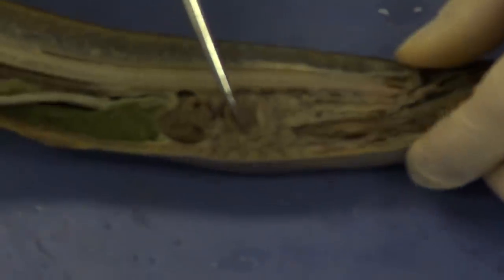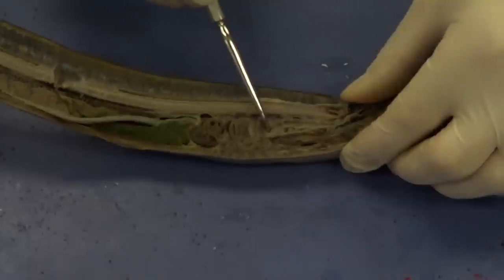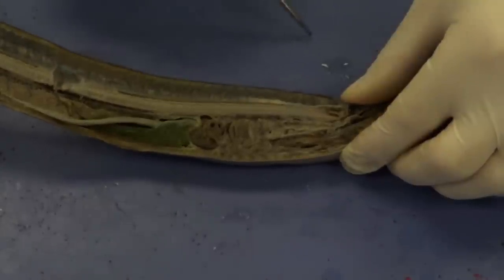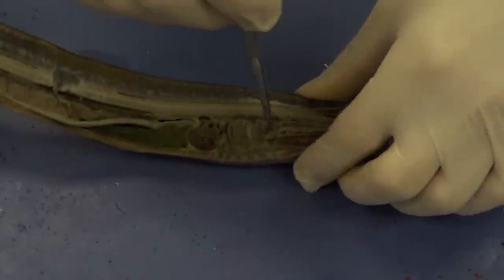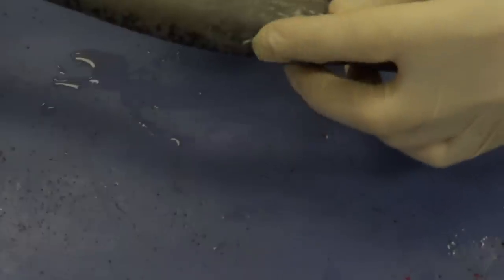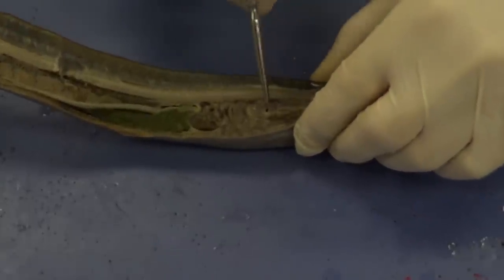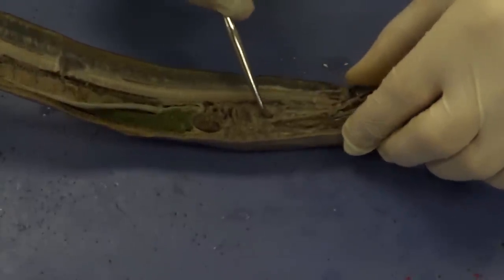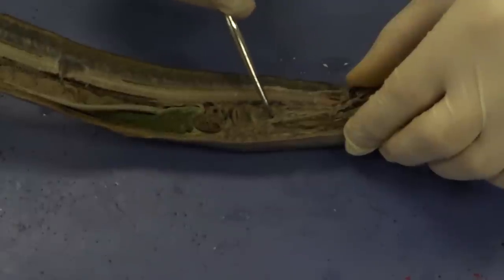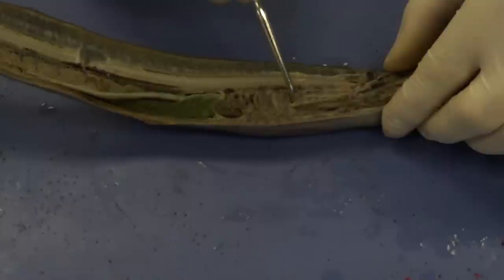These are all gills right here. We can see an opening — this opening is the internal gill slit. If we follow that and put the probe in there, it actually comes out the back through an external gill slit. So water is going to come in through the external gill slit, go into those gills, and eventually reach the internal gill slit. So these are all gills, and that is an internal gill slit.